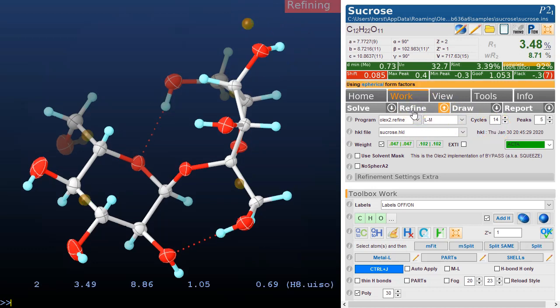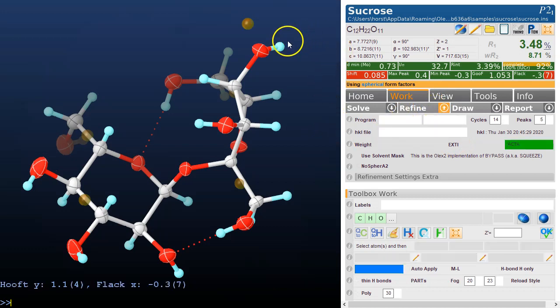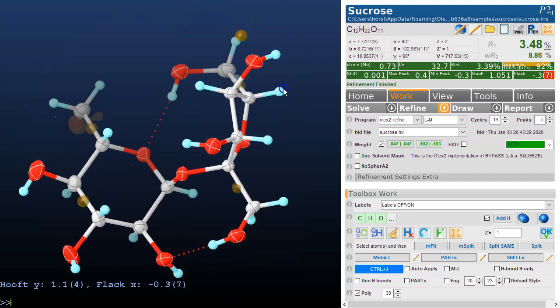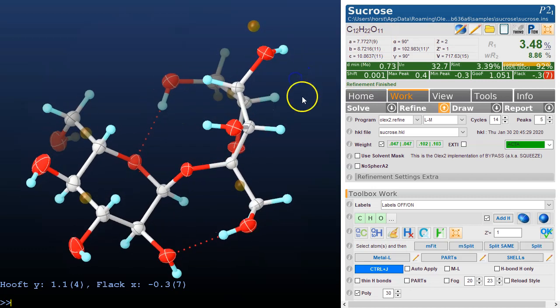The hydrogen has been fixed in this position. If we hover the mouse we should see that it's been afix 147, so that's supposed to turn it around but that's not happening here. One thing we can do is go in Toolbox Work and click on this thing that's called split, but it also means move.